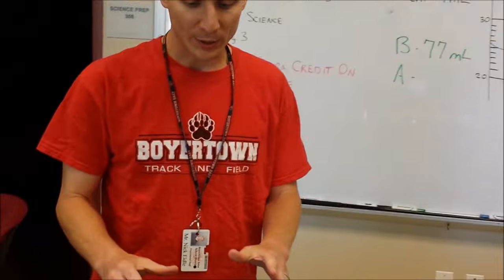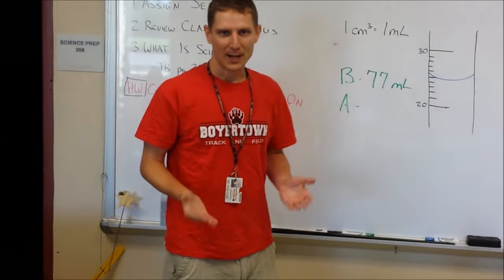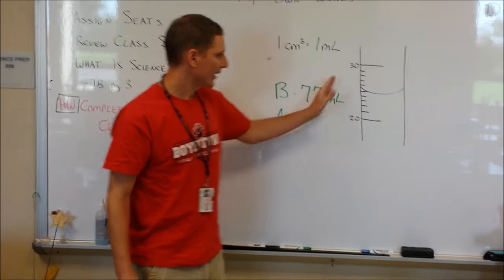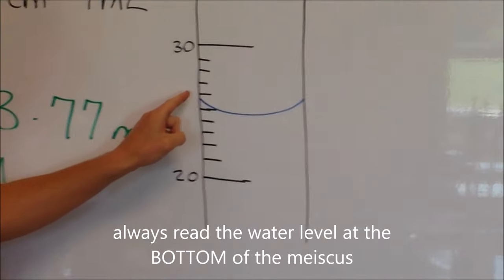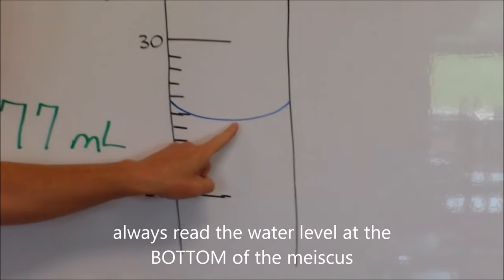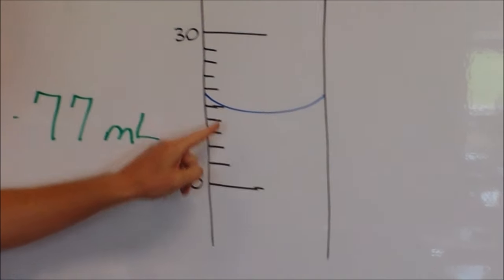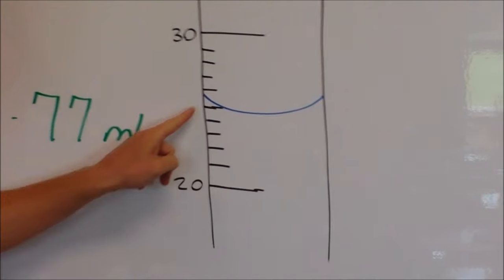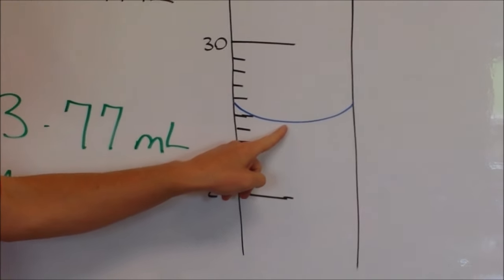When you're reading a volume like this, we need to make sure that we're reading it at the bottom of the meniscus. So if we're taking a look at this graduated cylinder here, which we drew on the board, you'll notice that the meniscus is kind of curved. And we always want to read at the bottom of this part. So if I was reading this meniscus, this reads 25 milliliters, not 26, because we always read at the bottom.